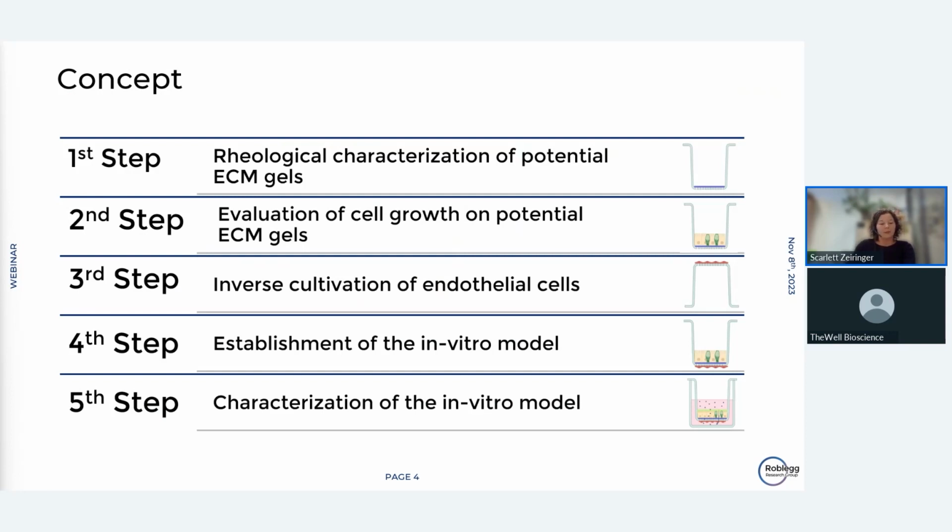And finally, the model was characterized with regards to their mucus formation, morphological structures, for example, the formation of tight junctions, as well as cell differentiation. Furthermore, permeability studies were performed with defined drug groups.